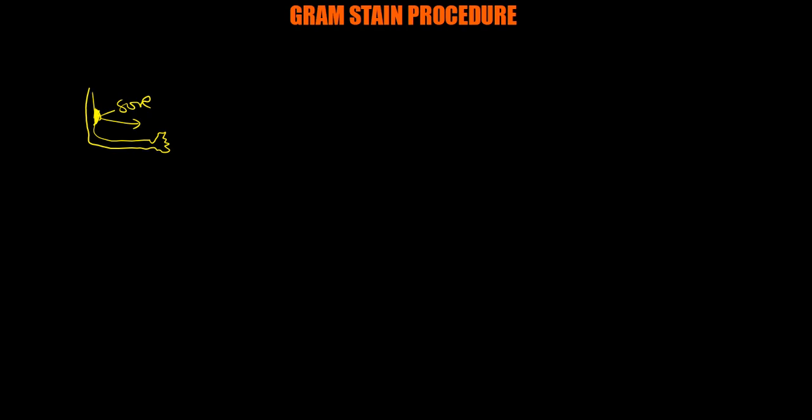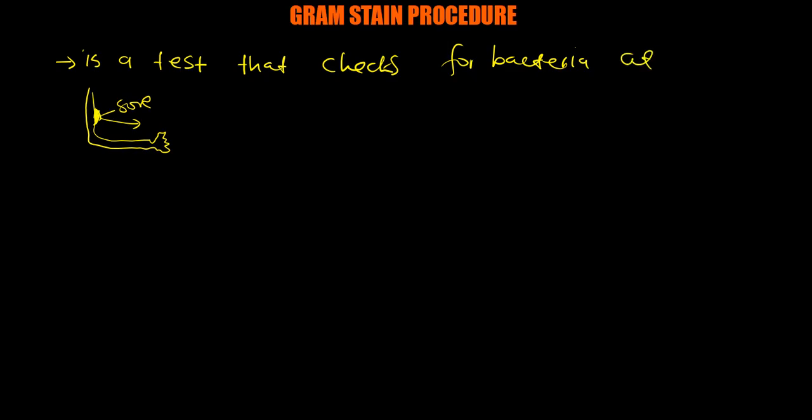What is the purpose of this Gram stain procedure? I'll define it as a test that checks for bacteria at the site of suspected infection.